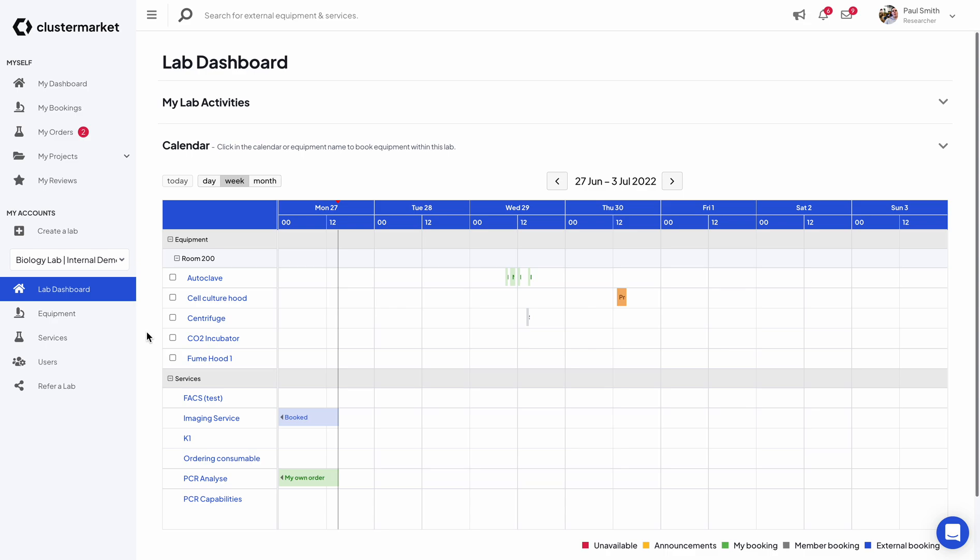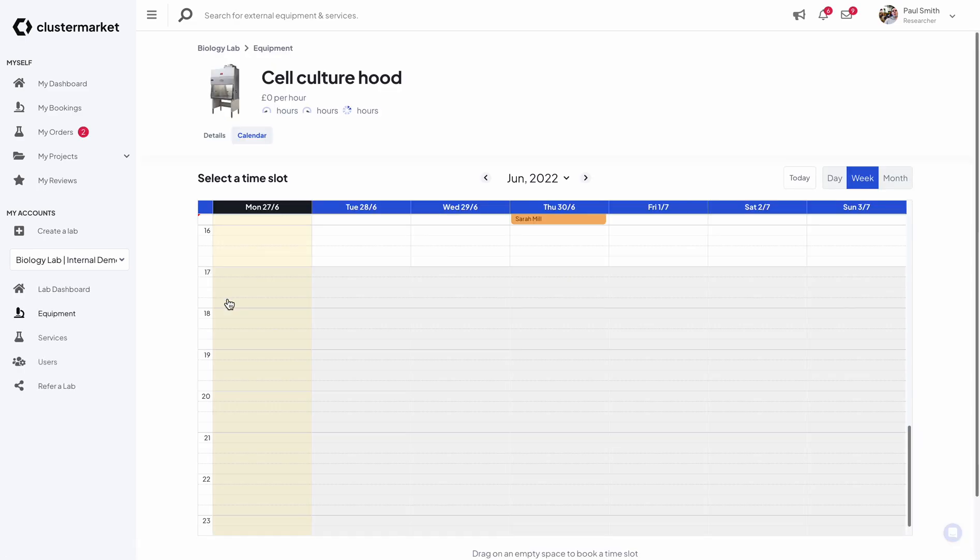The first step is simply choose the equipment from the dashboard. In this case I'm going to be booking the cell culture hood because I need it for the next month.